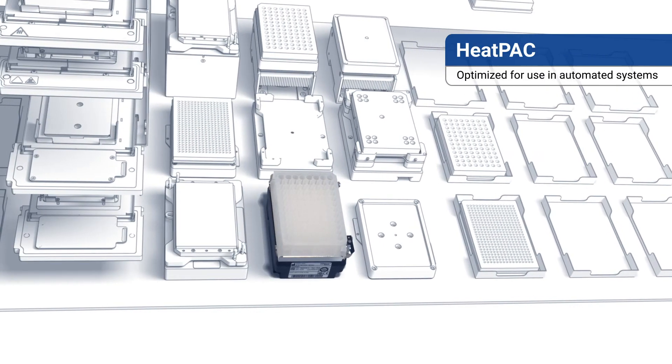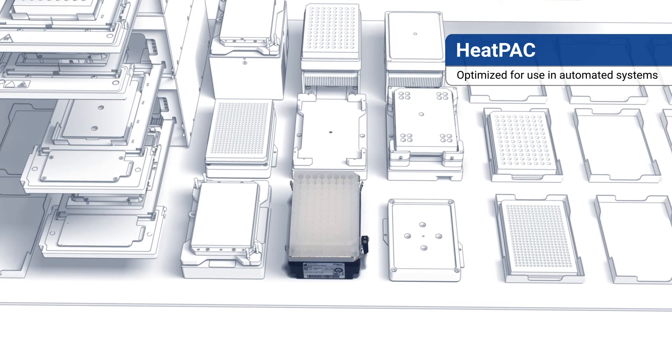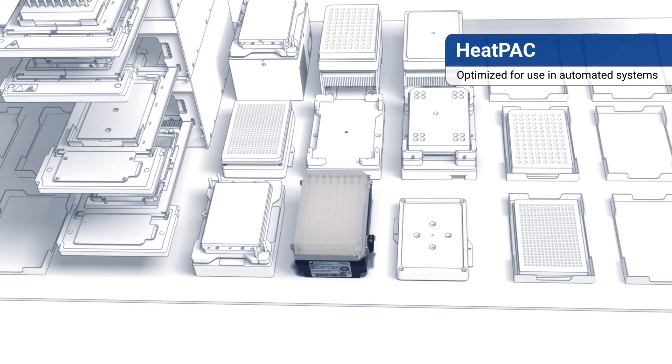INHECO's HEATPACK is integrated with all the world's major deck manufacturers, enabling immediate plug-and-play for your liquid handling solution.